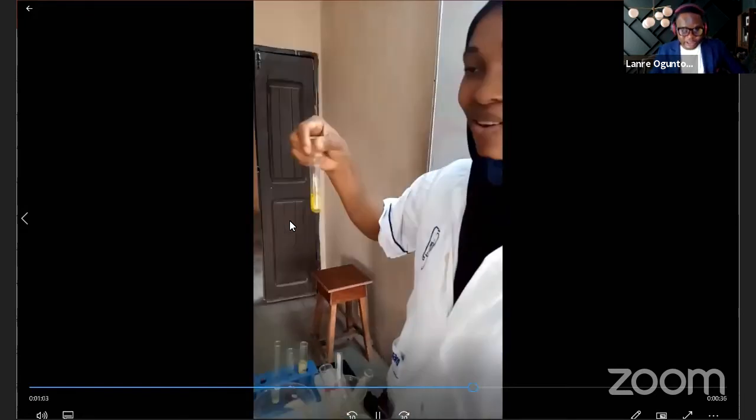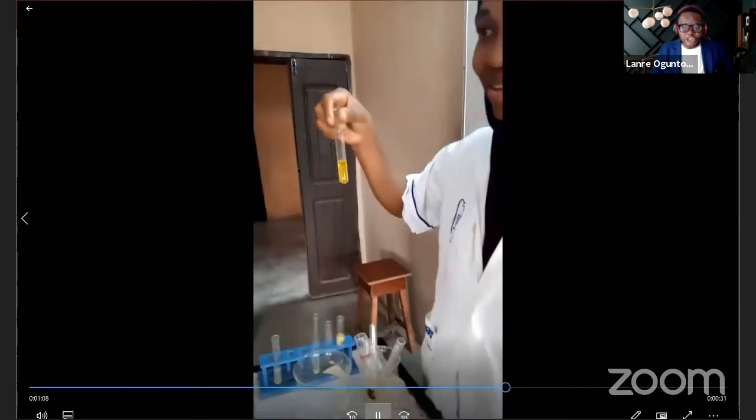What is expected is that the orange color is gradually fading away. That color changing from orange to green indicates that your potassium dichromate has been reduced. We have three types of alcohol: primary alcohol, secondary alcohol, and tertiary alcohol.